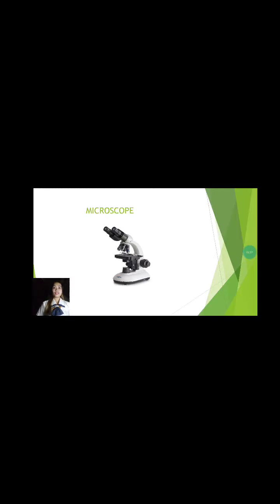So, as you can see, this is a microscope. Unsa man ang microscope? This is an optical instrument used for viewing very small objects such as mineral samples or animal or plant cells, typically magnified several hundred times. So, korektong giingon ni Miss Pitagara about the microscope. Nakaila naman ta sa microscope, usa-usahon nato ang parts ug ang functions.